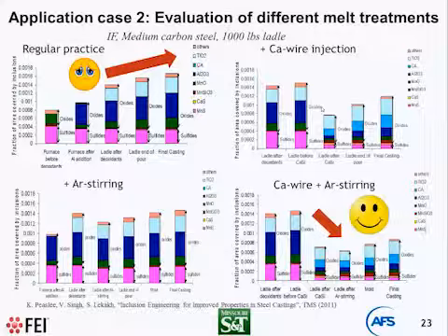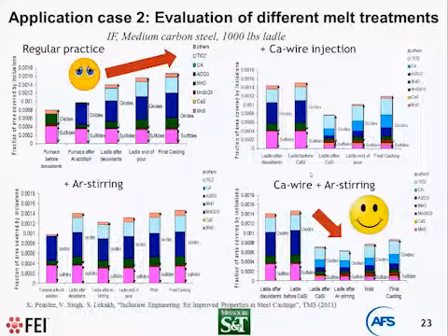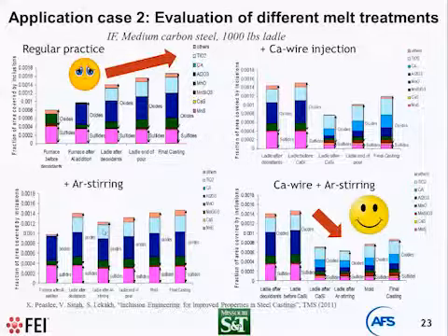Suddenly we have a drop, and then we still have reoxidation, and the final product also shows the same trend, an increasing amount of inclusion. Then look at argon stirring. Argon stirring is simple mechanical stirring; it does not change chemistry, and the automated system indicated nothing changed with chemistry. You can see approximately the same ratio between different classes, but the number of inclusions did not change and did not significantly go down.